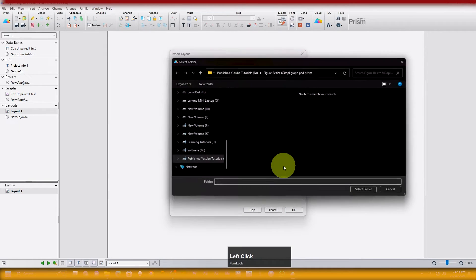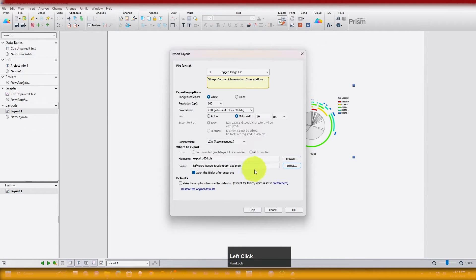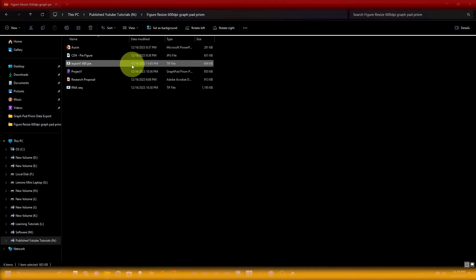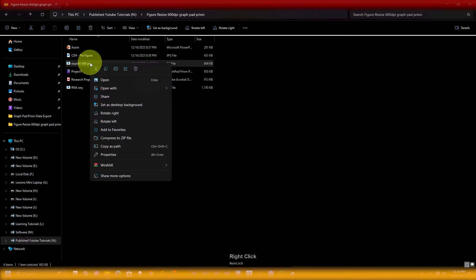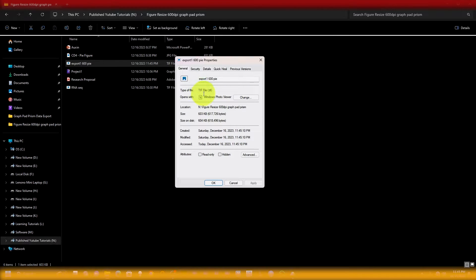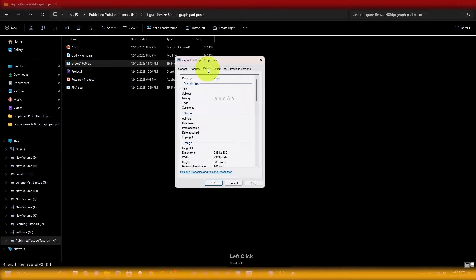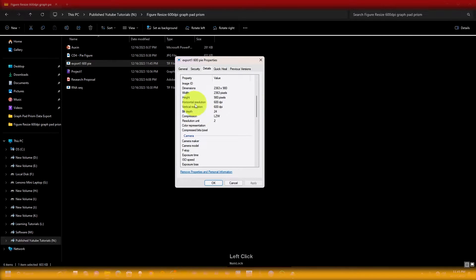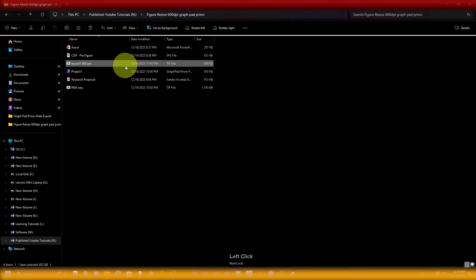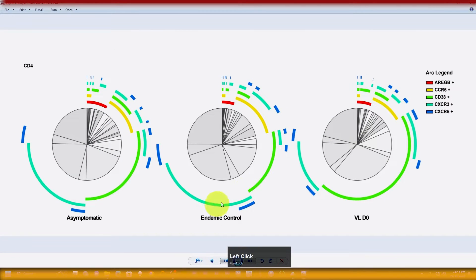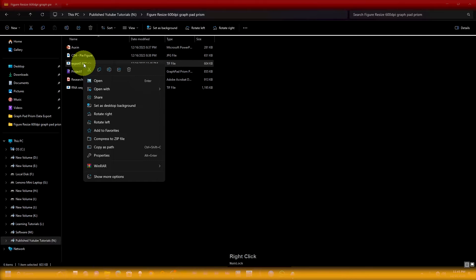Select the folder location where you want to export and click OK. Now you can see the file is exported. If you check the properties by right-clicking, you can see the file format has changed to .tif. If you click on the details tab, you can see the resolution is now 600 dpi. In this way, you can change your resolution and format for your figure.